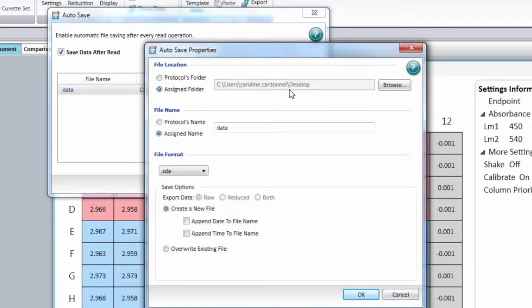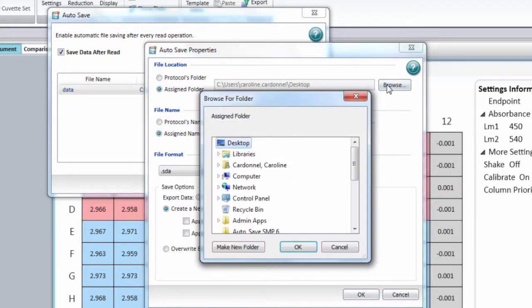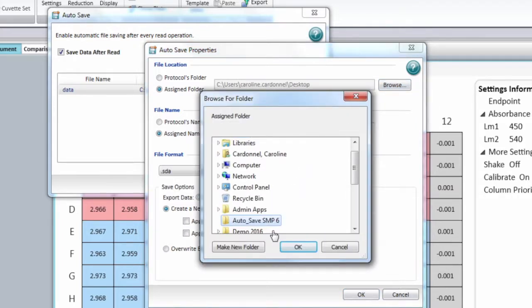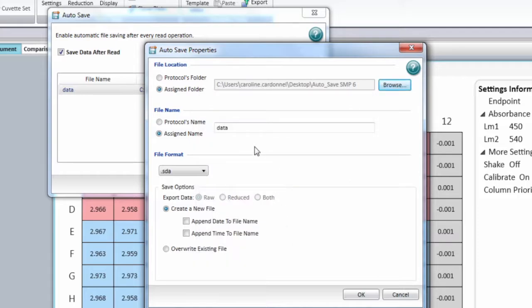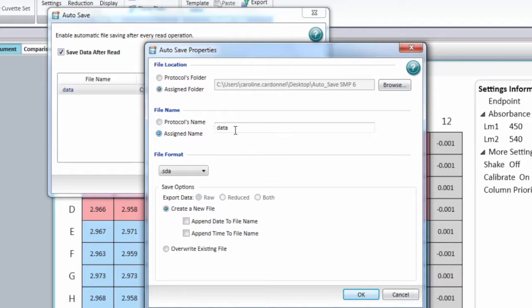Here, you can then change the file location and you can browse to the location of your choice. You can change the file name, and it can be either the protocol name, or you can assign a specific name and enter the name of your choice.